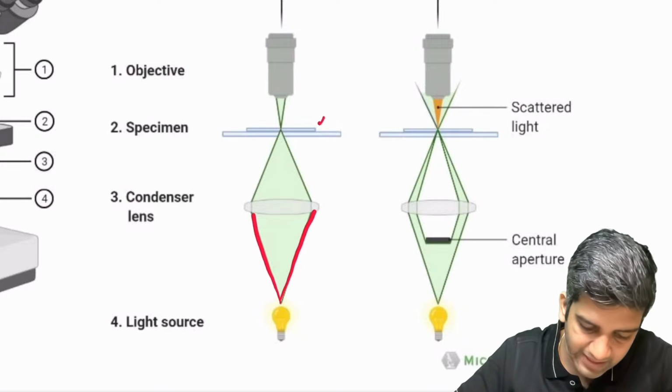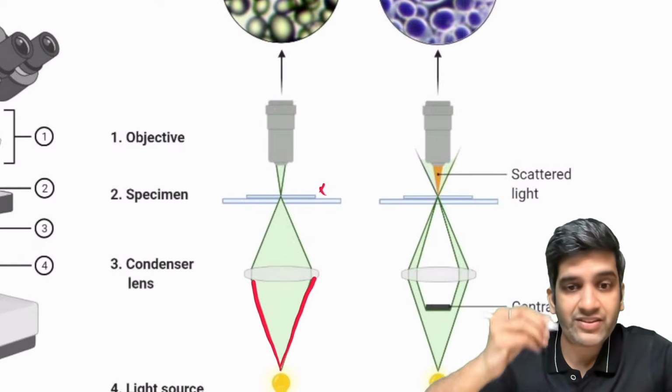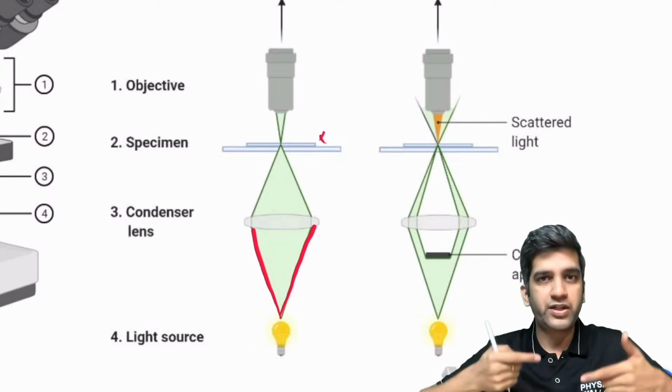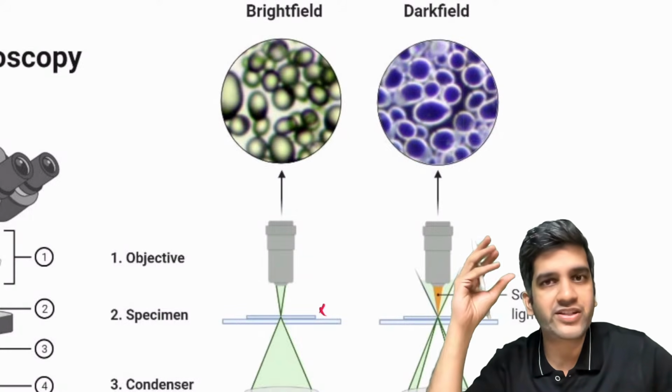It went on the slide. This is a stage where the slide is there. Then I have the objective lens. Then I have the eyepiece, right? So the light beam goes like this, falls on the slide, and then goes to the objective. I look at the eyepiece. So it gives me a color, whatever based on the stain, I see them, right?